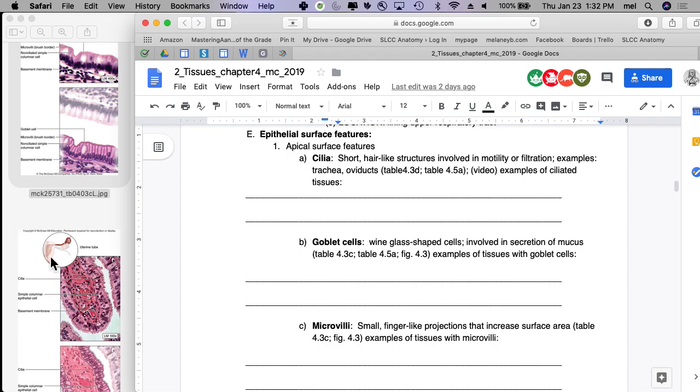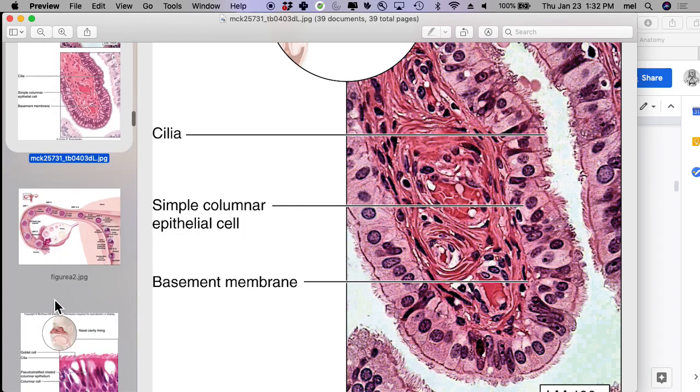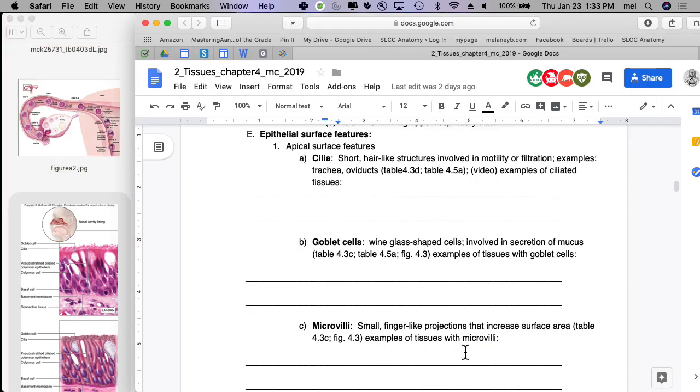So really all you have to do in that instance is be able to tell this tissue, especially if I point at an area that looks distinctly simple, which I will do, because when they're under cell division, they look a little confusing, right? You have to be able to tell that tissue from that tissue. And does that tissue look simple any place? No. So what you need to do is find a logic that will allow you to simplify the criteria every single time. And it gets really easy after you've practiced it a little bit. Okay, so those are your 2 ciliated tissues.